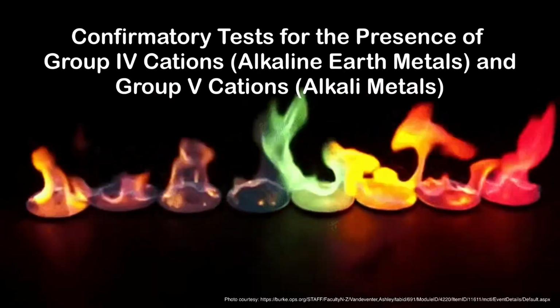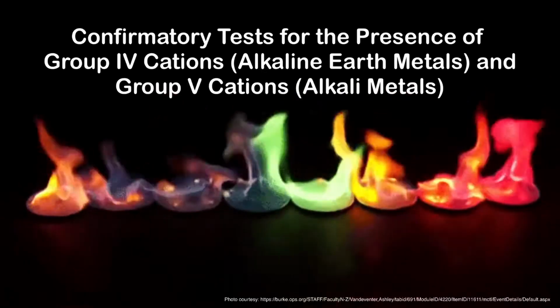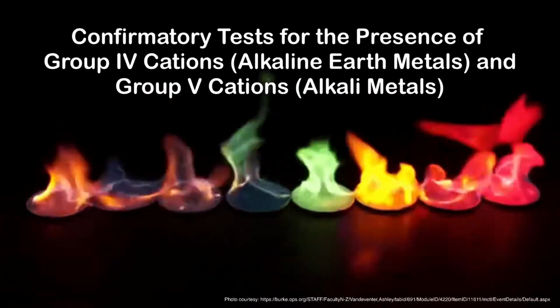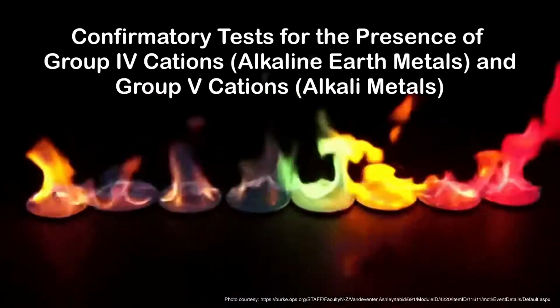Hello everyone, so for today we will talk about the confirmatory tests for the presence of group 4 cations and group 5 cations. These cations are from alkaline earth metals and alkali metals respectively.